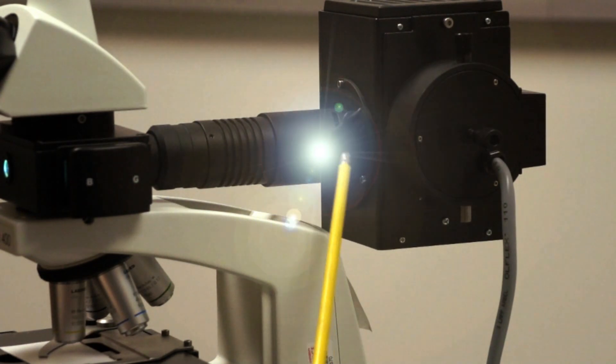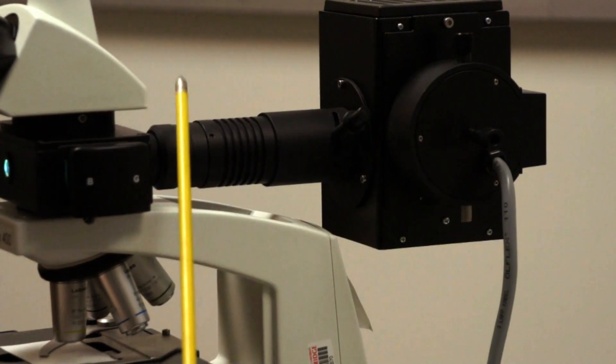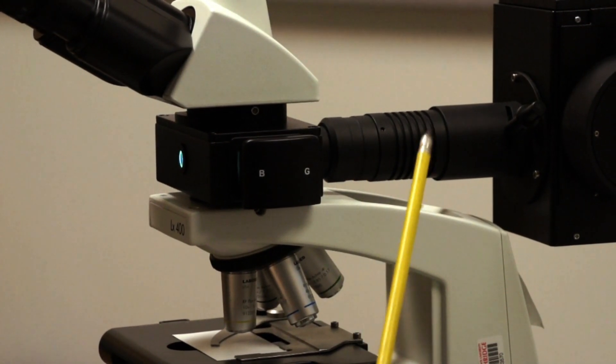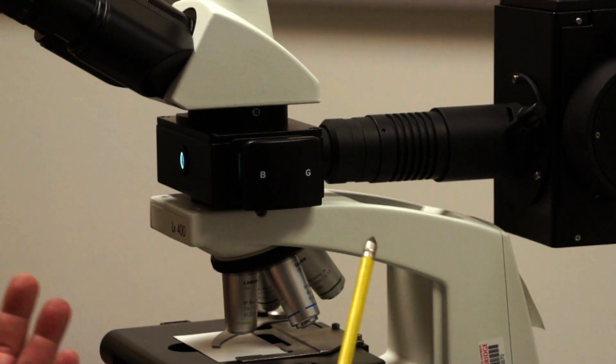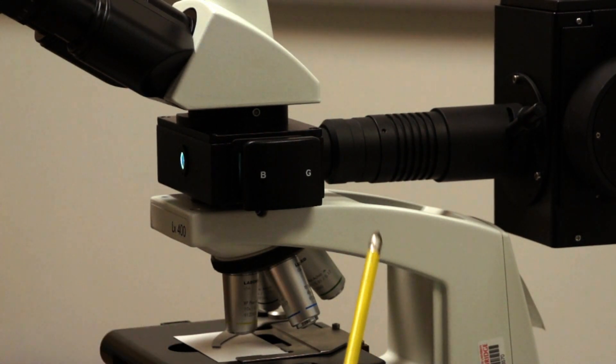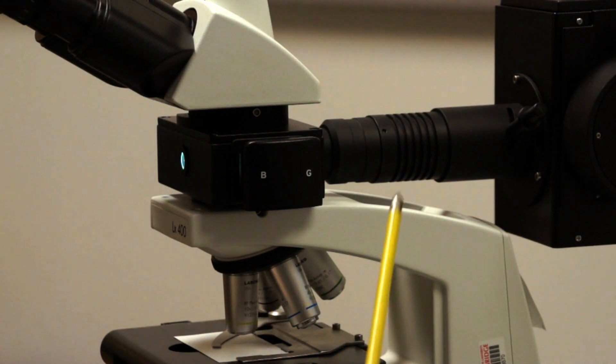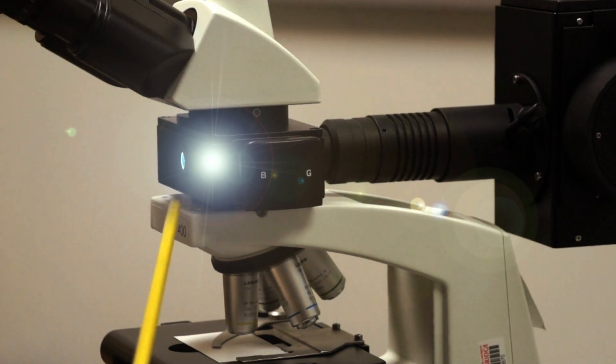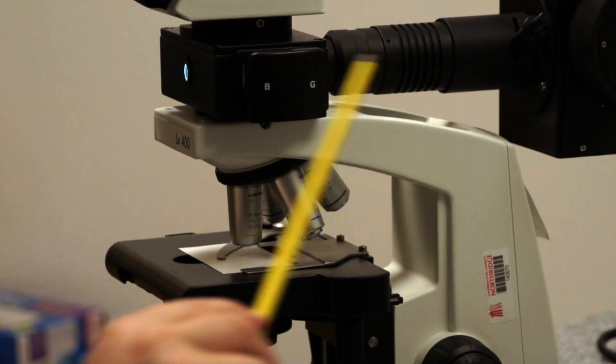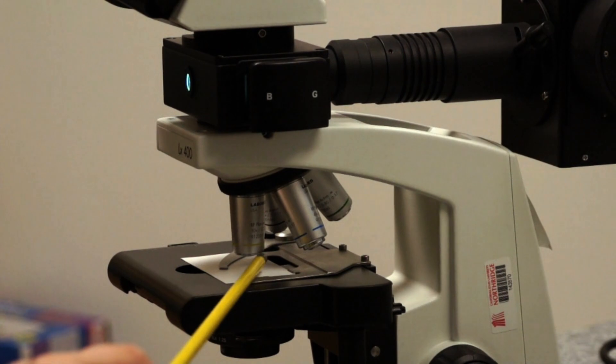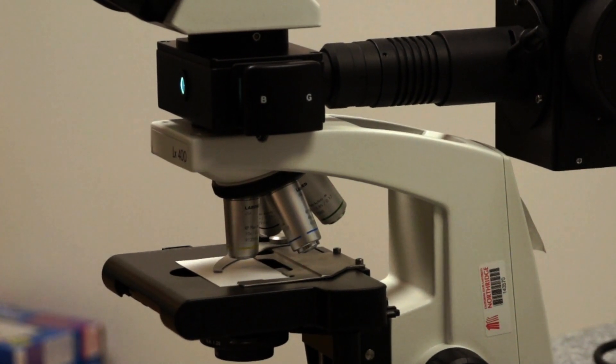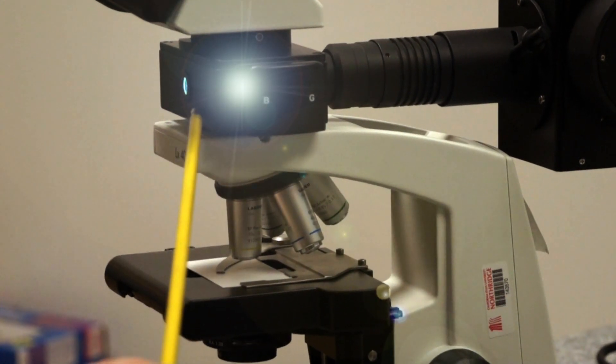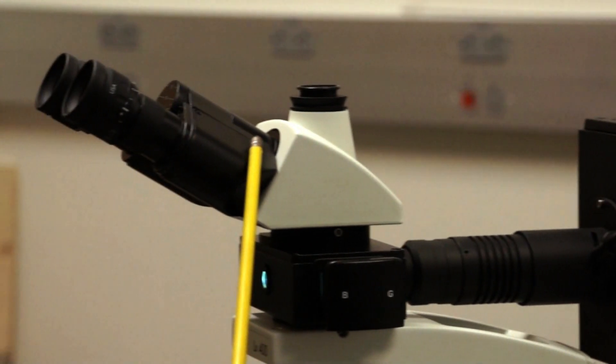But the light travels from the lamp house through the vertical illuminator. It goes through an excitation filter, which is a specific color that's used to excite our fluorophore, which we'll discuss more about later. It goes through the excitation filter, then it hits a mirror and is reflected downward to the specimen. So this is reflected light hitting our specimen. Then the light that is emitted from our specimen travels back through the objective, through the mirror, which passes it to the binocular or trinocular head.